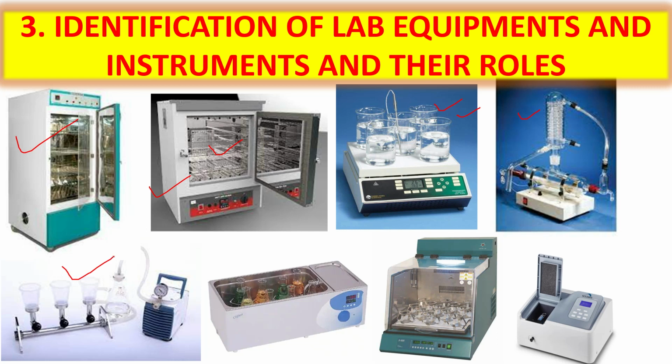Next thing is membrane filtration unit, where a membrane filter is present and the solution is passed through this membrane filter, and all the microorganisms which are present in this solution will be trapped in the membrane filter, and then we have to collect the membrane filter and place it onto a petri plate or agar plate, a specified agar plate, and then we can see the growth on the petri plate if the microorganisms are present in that solution. Okay, so this is the membrane filtration technique.